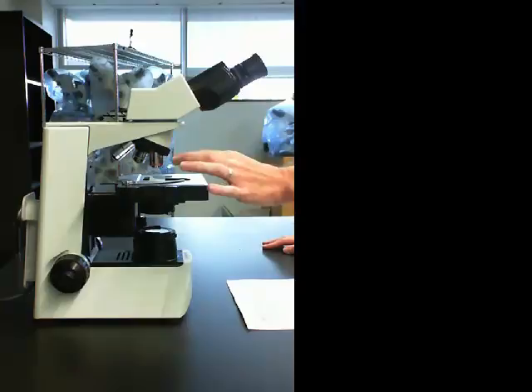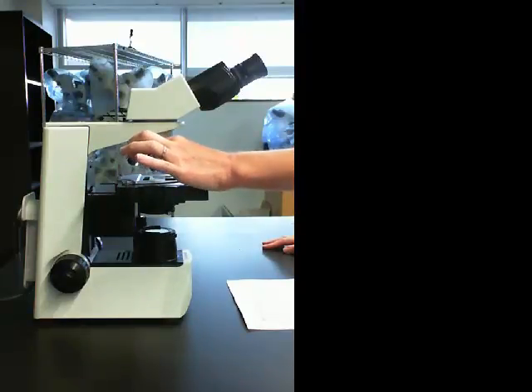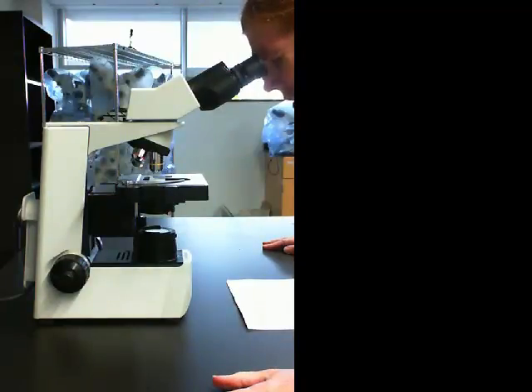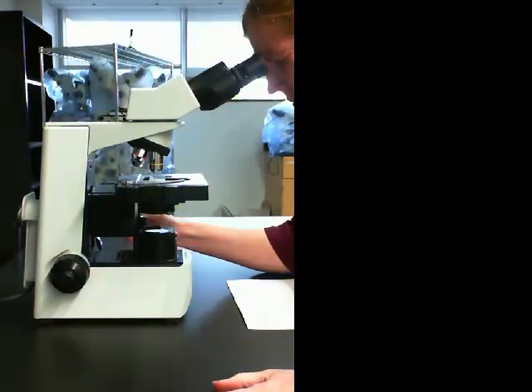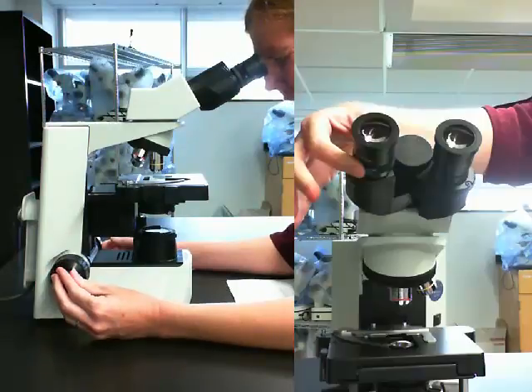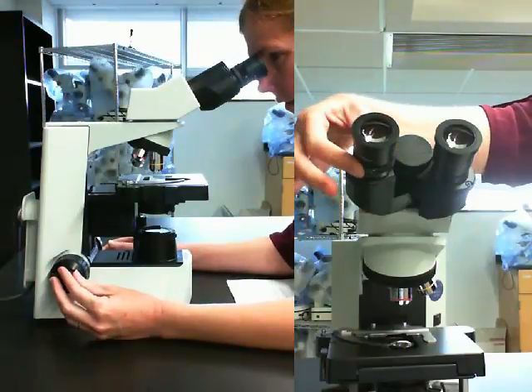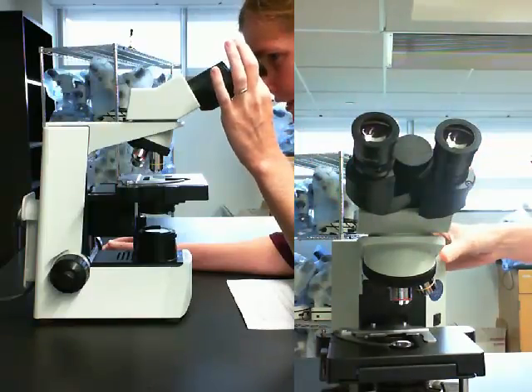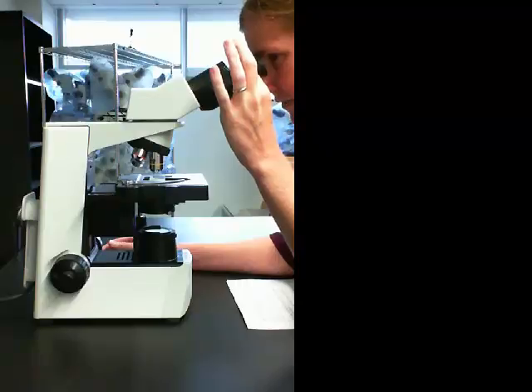Now we're going to go ahead and make sure that we have our 10x objective in place. And we're going to cover the adjustable lens, which is the left lens, with our hand, or close our eye, or somehow prevent our view through that ocular. Looking just through the right ocular then with our right eye, we're going to fine tune our focus using our fine adjustment knob. Once that focus is fine tuned for that right eye, we're then going to close the right eye and come up to the ocular lens and turn this ocular focus on the left lens until it is set for our left eye.